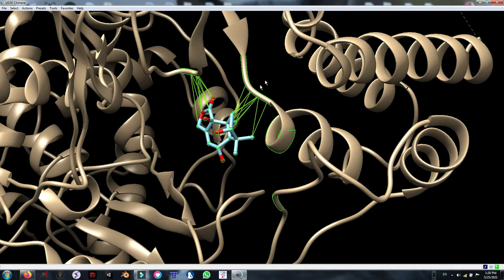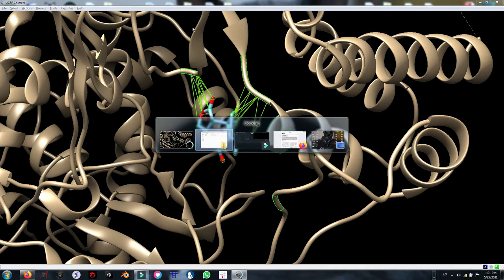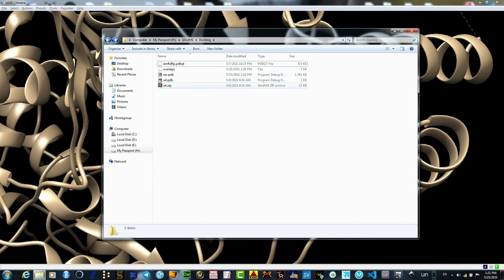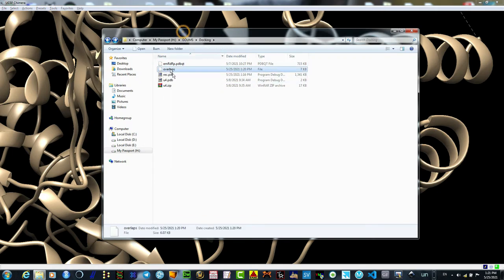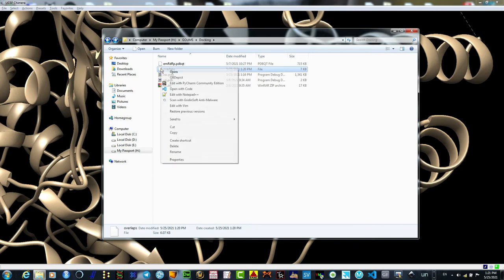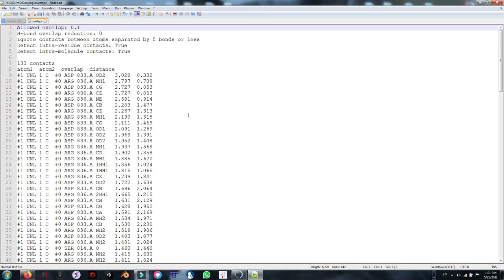As you can see, the amino acid residues involving the interaction with our ligands is highlighted in green. And pseudo bonds are also shown in the green lines. Here I can do several other things, but before that I am going to show you how to check our interactive residues in the overlap file. I am going to open it with a text editor, Notepad.